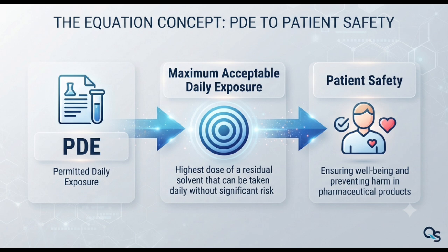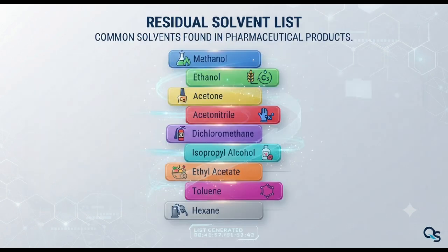PDE represents the amount of a solvent that a person can be exposed to every day over a lifetime without an appreciable health risk, based on the toxicological assessment. The PDE value is expressed in milligrams per day. The concentration limit for a solvent can be derived based on the PDE and the maximum daily dose of the pharmaceutical product.